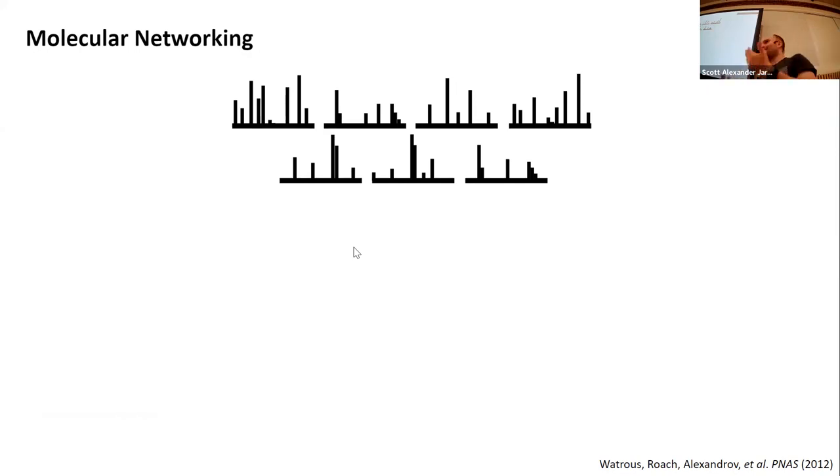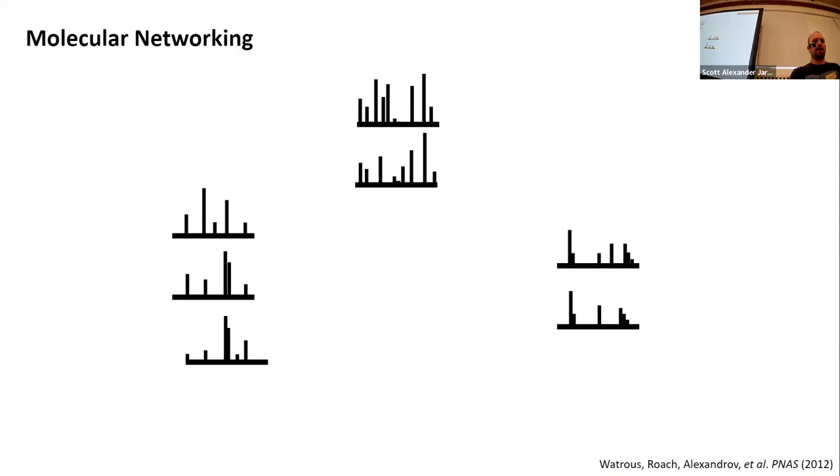It might be confusing to learn about multiple tools that do similar things, but I want to stress the concept they have in common: both MZmine, with the networking Robin did yesterday, and now GNPS use this modified cosine score to establish the spectral similarity between the MS/MS spectra.